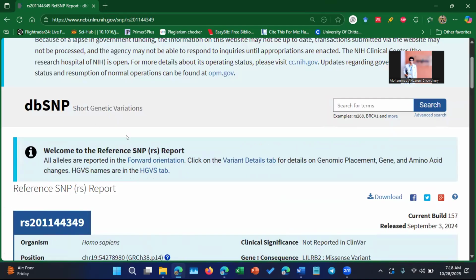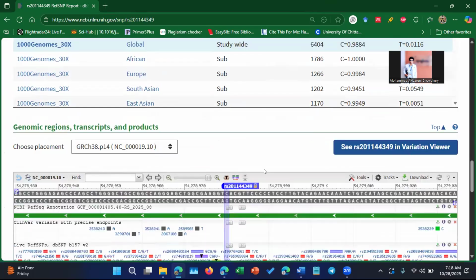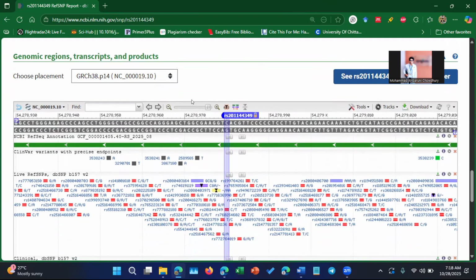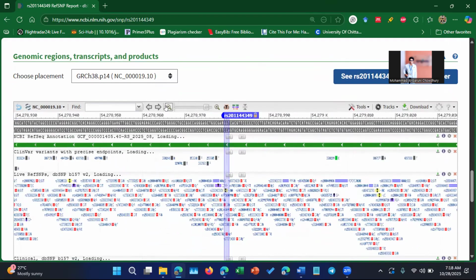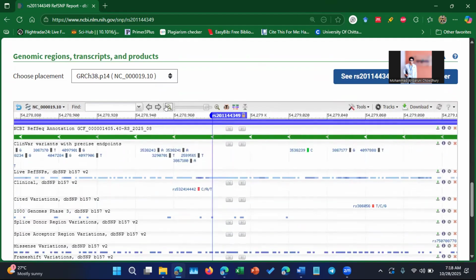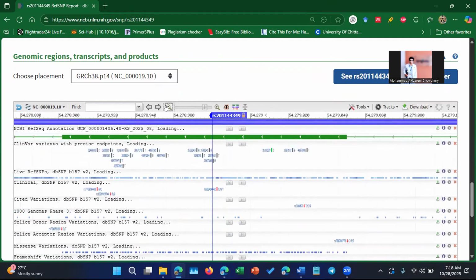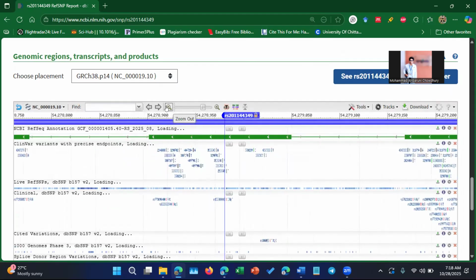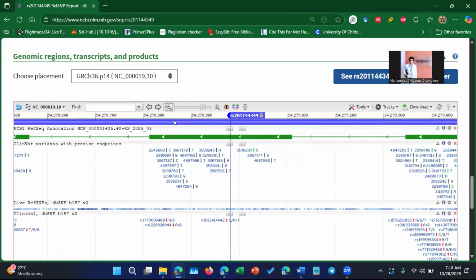So during primer designing, firstly, go here. Here is your interface of the genome viewer. Just zoom it out. See the difference, how much difference? It is 50 difference from this point to this point. If you see clearly, it's 900 and it's 950. So I am going a bit up.